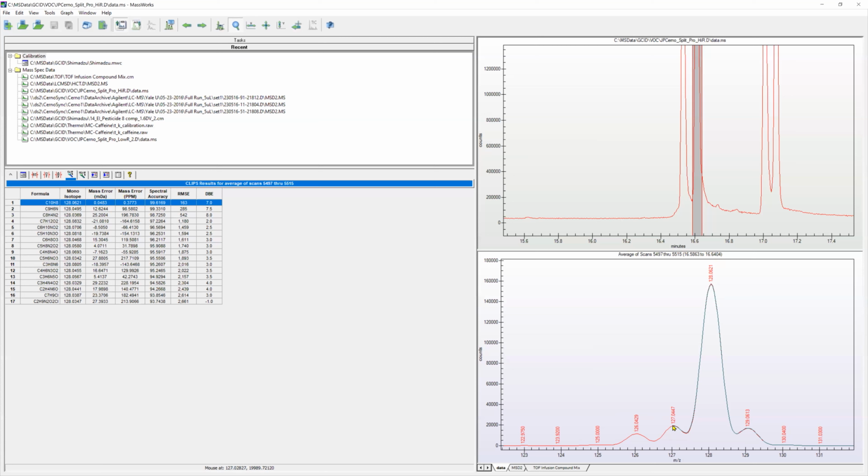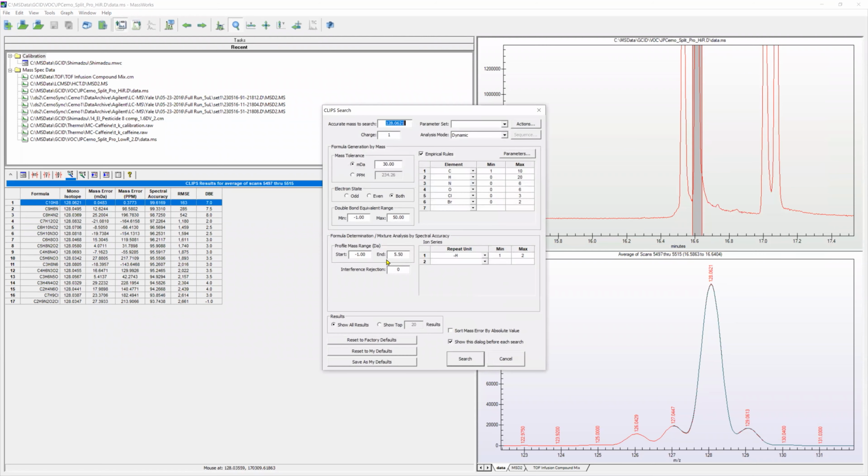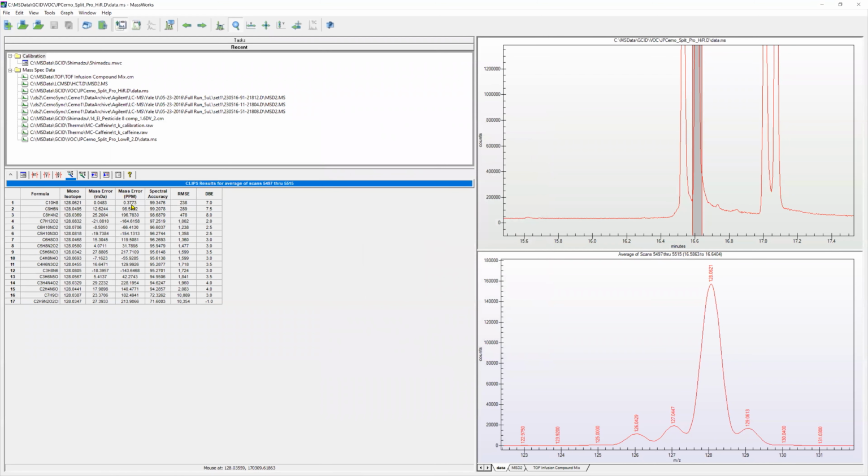So we only told the fit to happen starting at about 1 Dalton from the monoisotopic peak, but I can change that. So I can go and do the search. And for example, I want to start at about -3 or -3.5 from the monoisotopic peak. And now when I do my search and I look at the overlay, you'll see that it's also now fitting those other components. It's just a matter of the range of the fit.